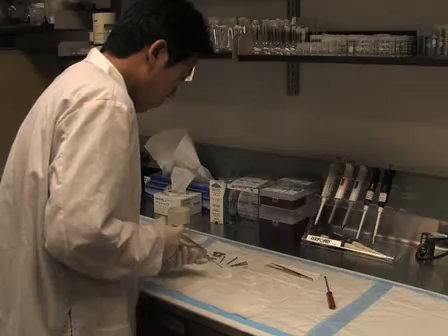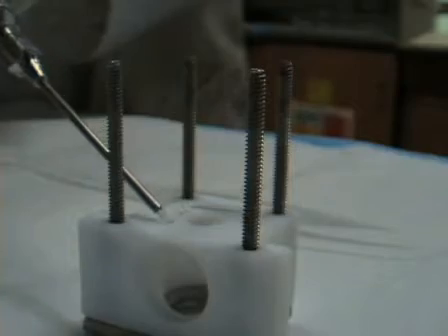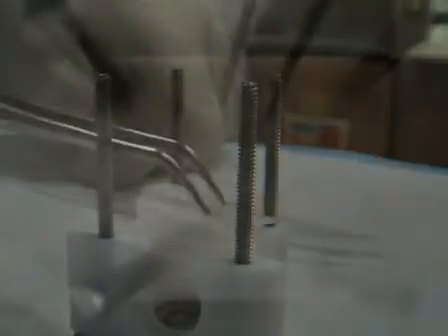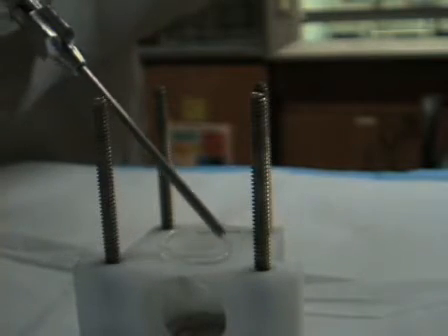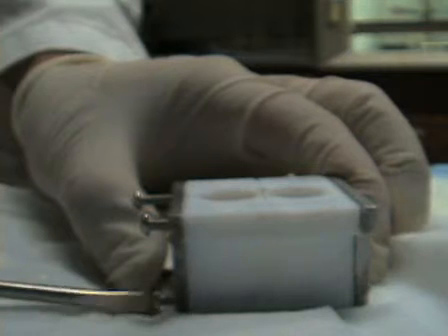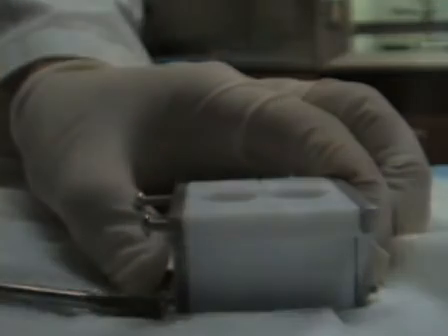Using petroleum jelly as a sealant, place a glass window in the front half of the Teflon chamber. Thread stainless steel screws through one metal brace and the four holes in the rear chamber half. Using petroleum jelly as a sealant, place a circular Teflon partition such that it will be sandwiched between the two halves of the assembled chamber. Ensure that the hole in the partition is centered. Apply petroleum jelly on both sides of the partition to ensure that the electrolyte compartments are watertight and electrically isolated. Continue threading the screws through the front half of the chamber and the front metal brace. Tighten the assembly to ensure that all components are held firmly in place, but not too tight.